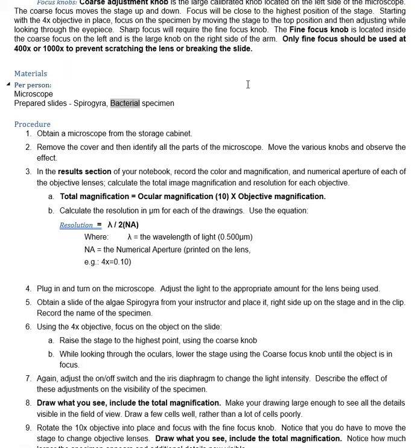The next thing you do is make sure that it is totally in the center. What you want to look at needs to be in the exact center. It's going to look like a little circle of light. That's what you're going to see. Needs to be centered. Why is that? Because when you go up, that circle of light is going to get smaller, and if it's not centered, you're going to lose it.